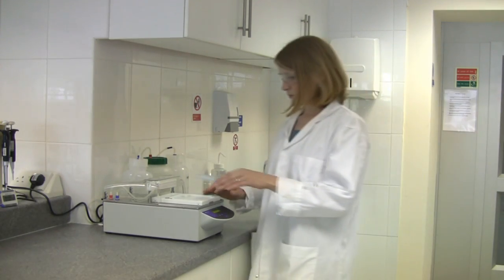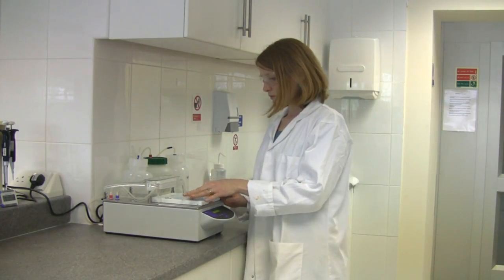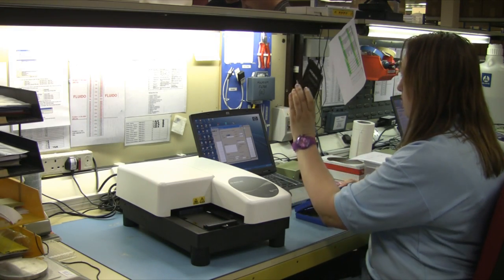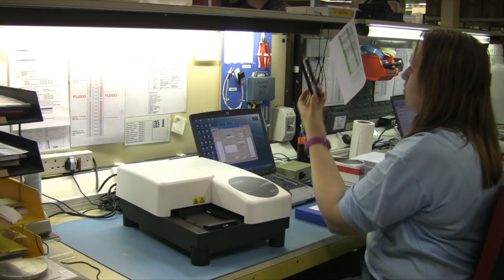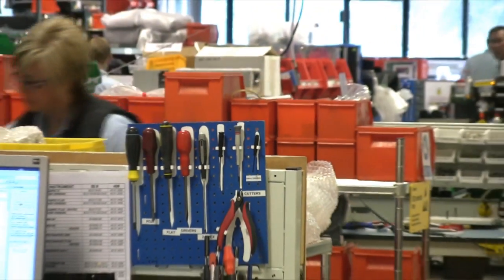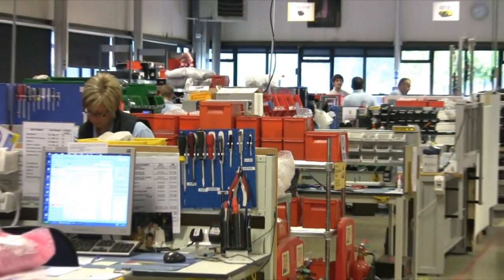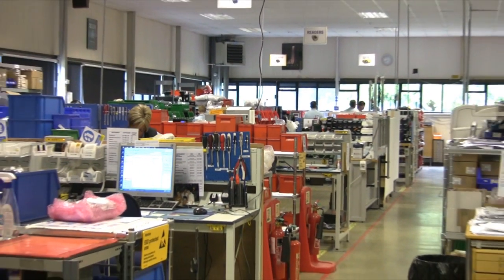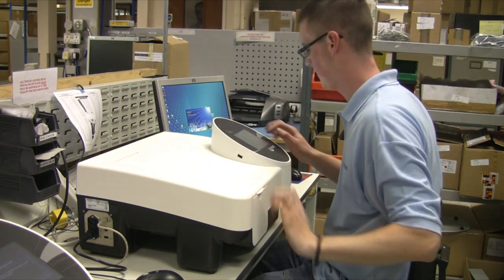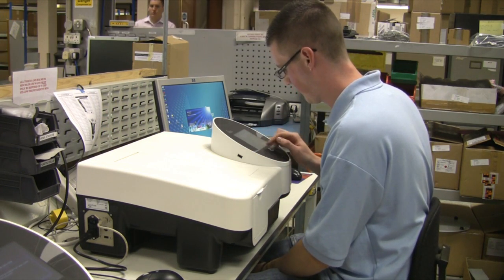The EasyRead 400 project was applications driven. Our product specialists worked hard to translate and anticipate the needs of the absorbance reader market into an instrument that fills a real customer need. Biochrom instruments are manufactured here in Cambridge, so we manage every aspect of product development and production. Modern processes and a strong commitment to quality ensure we can meet our goal of continuously exceeding our customers' expectations.